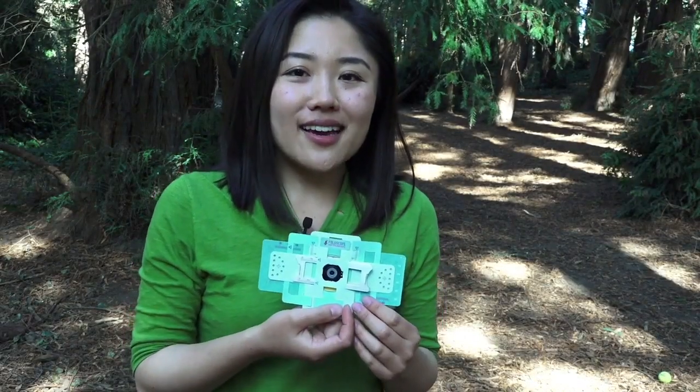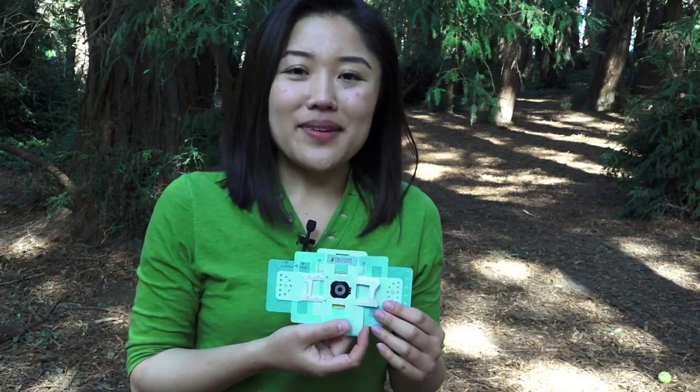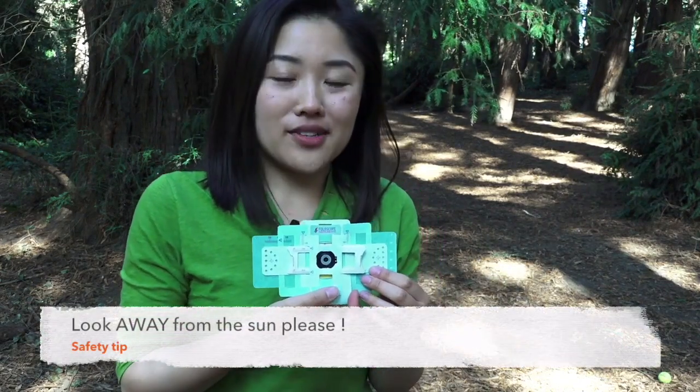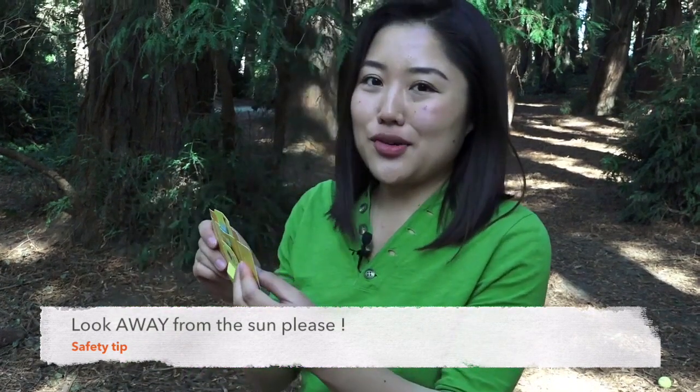When you're using the sunlight as your light source like I am today, make sure you're looking away from the sun. We want to make sure that you don't hurt your eyes.